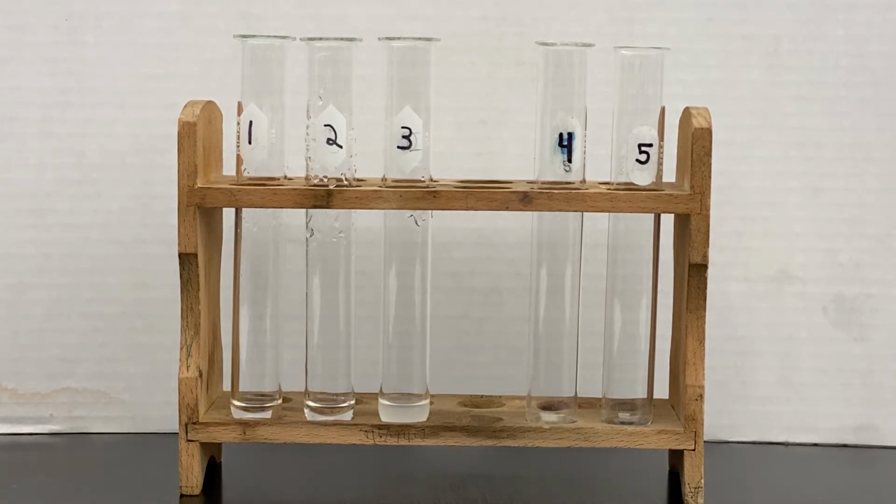The next thing I'm going to do is add my Benedict's chemical indicator solution, and I'm going to add 30 drops to each test tube.